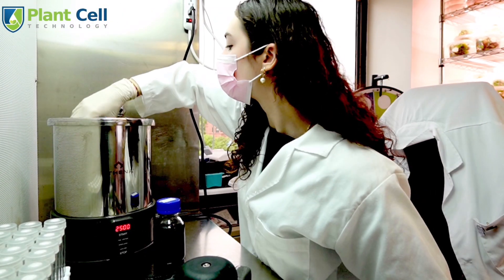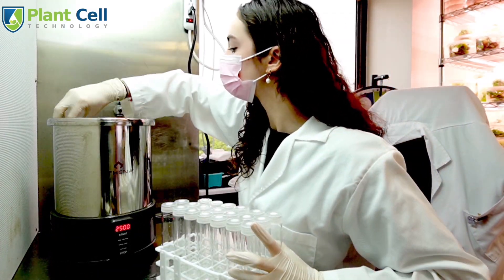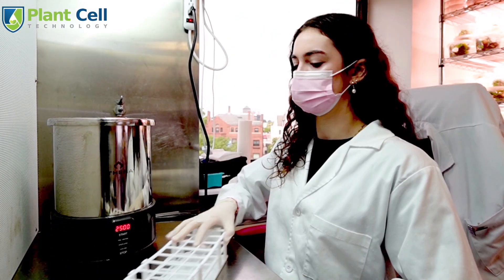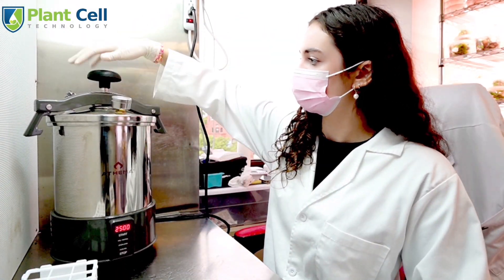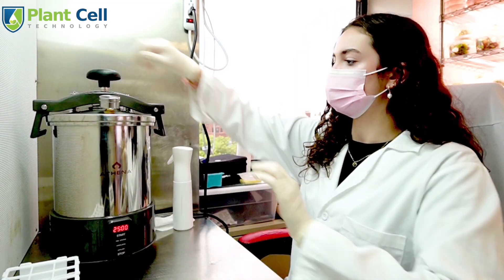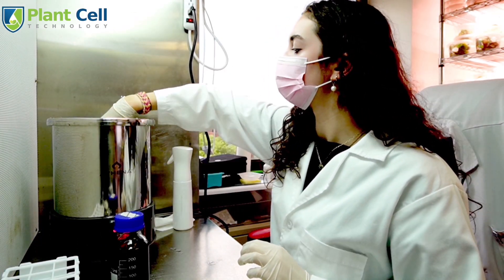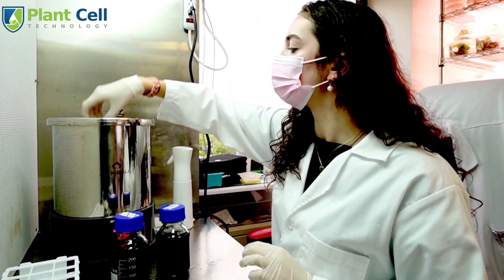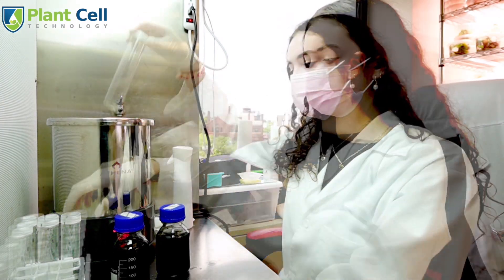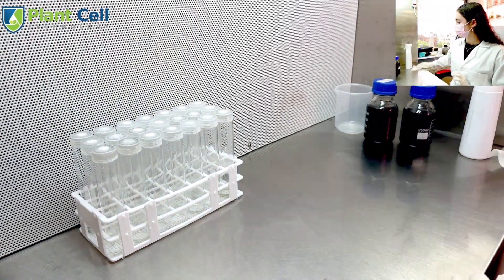You will add both media containers and test tubes into the pressure cooker. Screw on the lid and don't forget to press start. 25 minutes later, first open the valve to release extra pressure and take out the media containers and test tubes. Once you are finished, it is time to pour the media.